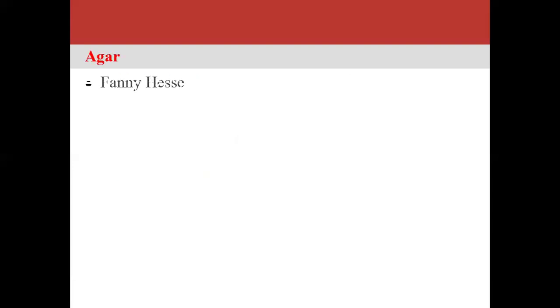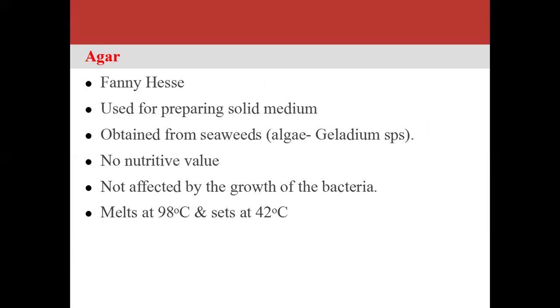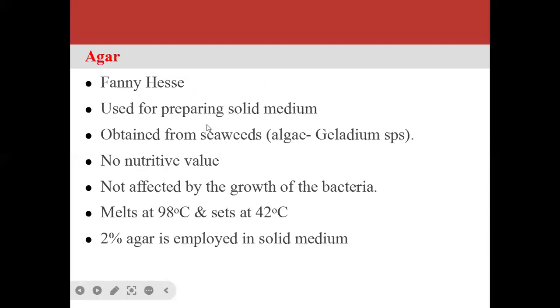And next, agar. Agar acts as the solidifying agent. It was introduced by the scientist Fanny Hesse. She is considered the mother of microbiology. Agar is used for the preparation of solid medium. And agar is extracted from seaweeds, that is, from algae. That is Gelidium species. It is obtained from Gelidium species.